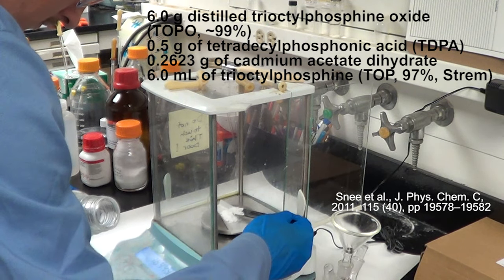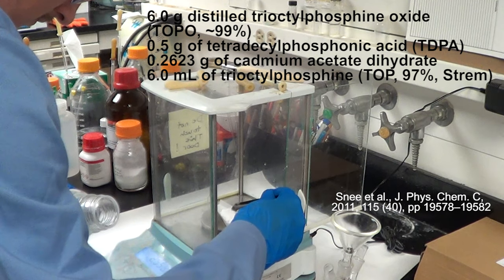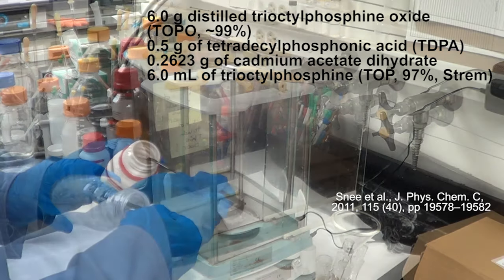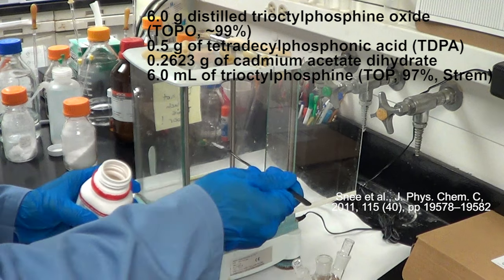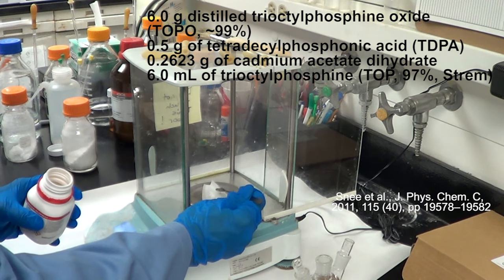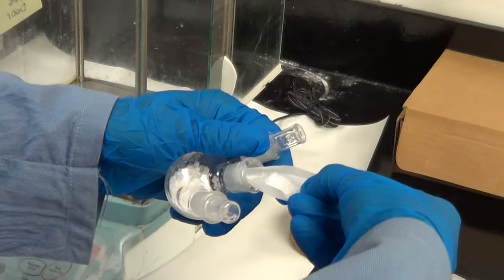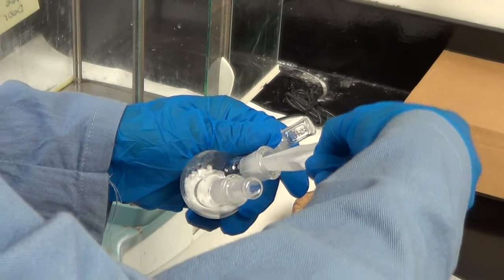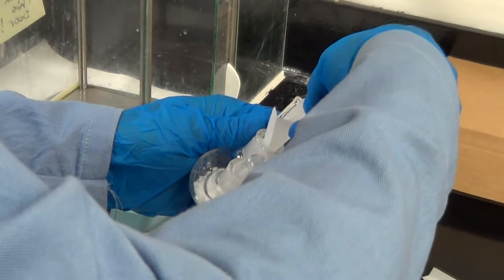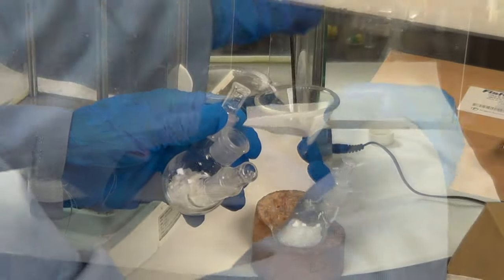We're also adding half a gram of tetradecyl phosphonic acid. We actually have a video showing you how to prepare that material, or it is also commercially available. And we are also weighing out some cadmium acetate dihydrate that gets added to this 50 mL round bottom flask. The next thing is we are going to tie that into the Schlenk line and degas it.